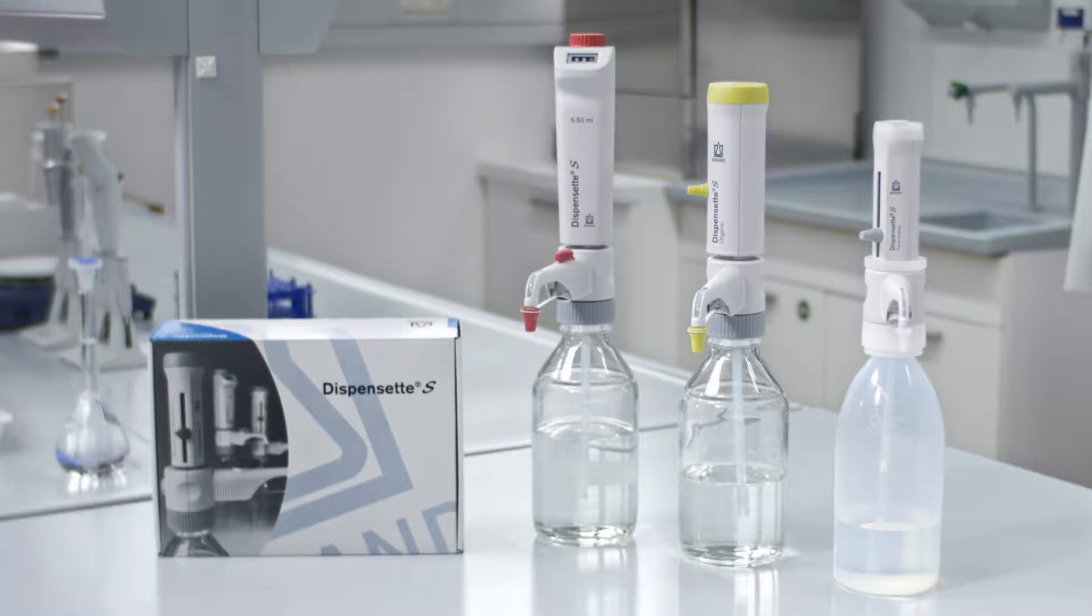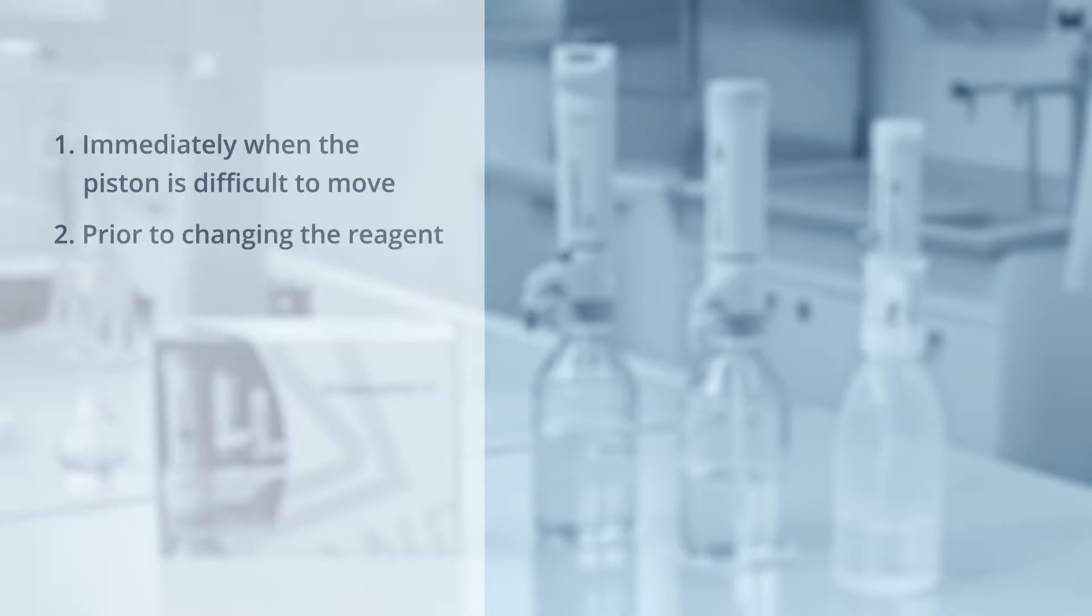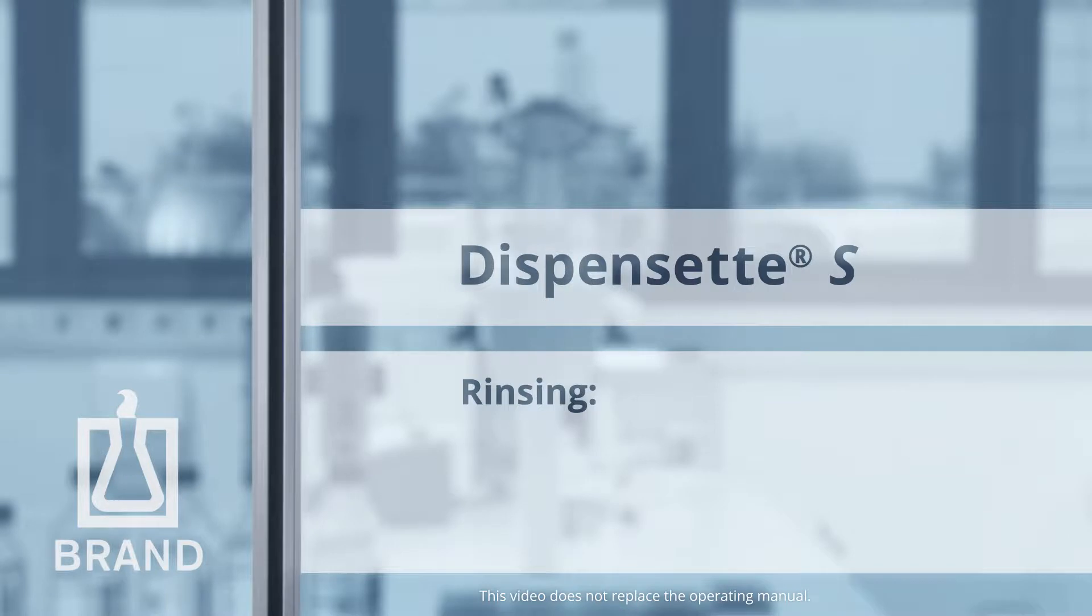Additionally, the instrument should be cleaned under certain circumstances: immediately when the piston is difficult to move, prior to changing the reagent, prior to autoclaving, prior to disassembling the instrument, and prior to long-term storage. Your Dispenset S should be rinsed prior to changing the reagent and before disassembling the instrument.